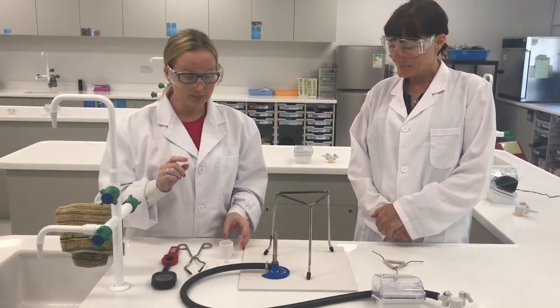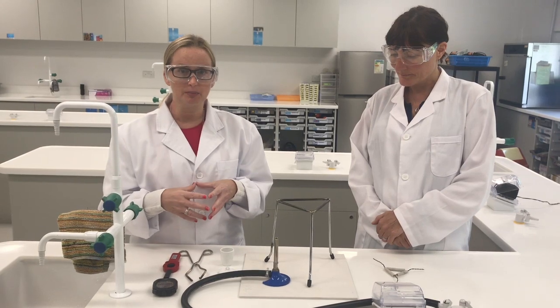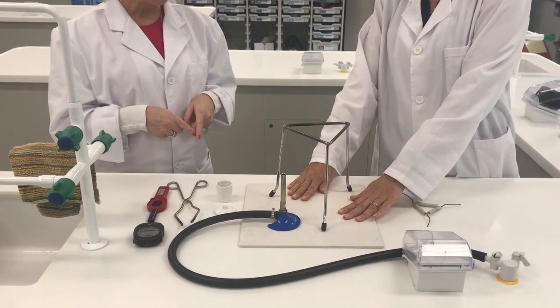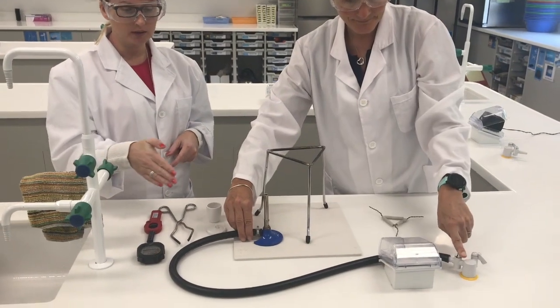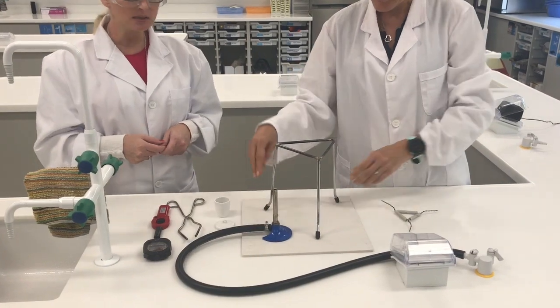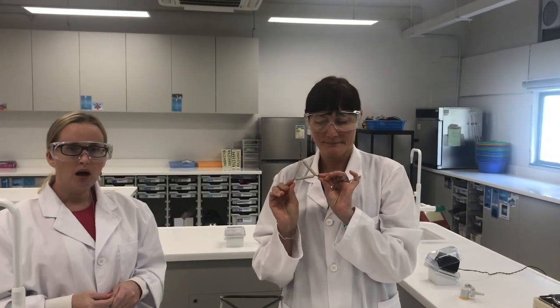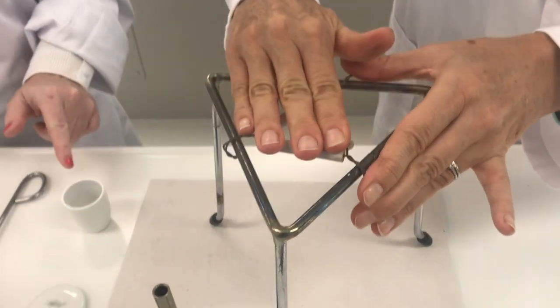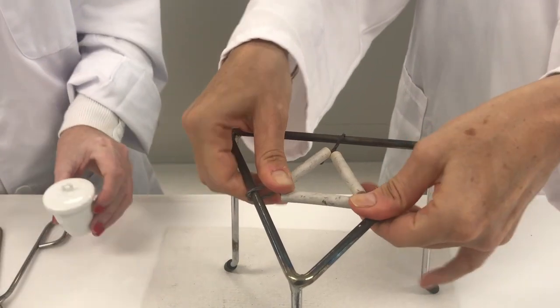To carry out this practical you need a specific set of equipment set up in a specialised way. First, you need a heat proof mat, a Bunsen burner securely connected to your gas tap with the hose safely on the bench and not hanging over the edge. You need a tripod stand and a pipe clay triangle on which you will place the crucible with some copper powder and a lid.